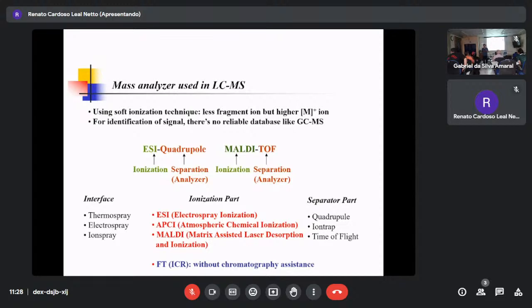For lipids, APCI is a matter of sensitivity, how much they can ionize. But in lipidomics, the problem is not sensitivity, because there is a lot of lipid. It's a resolution issue. So for resolution, mass information alone is not enough, and ion mobility information is a little bit important. Do you understand my question? So that's ionization. Even for glucose and so on, it depends on the machine, it's completely different, so that's why I cannot say.